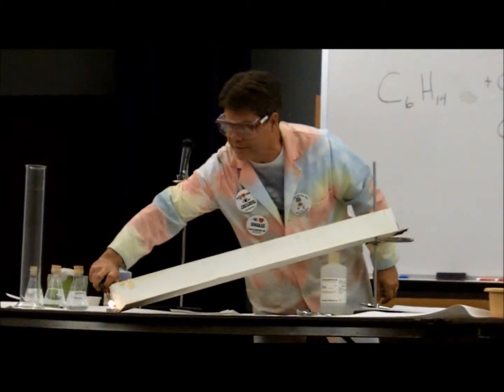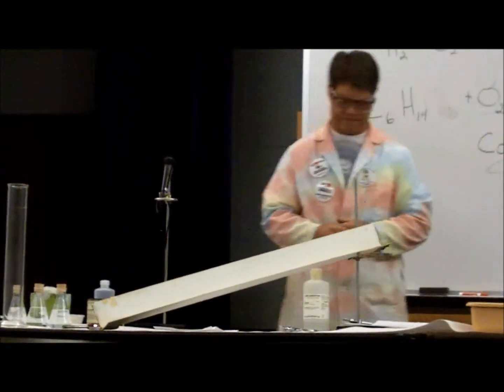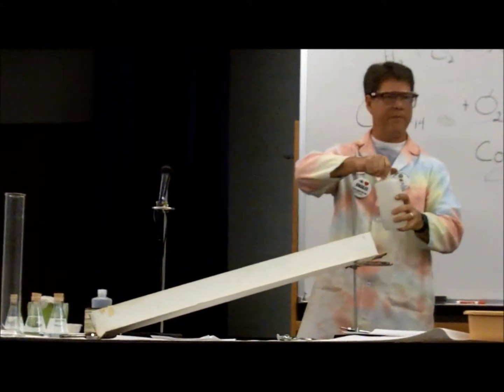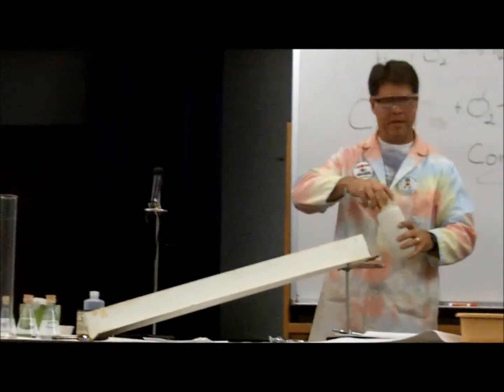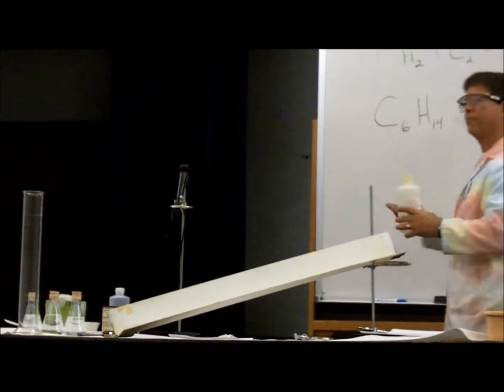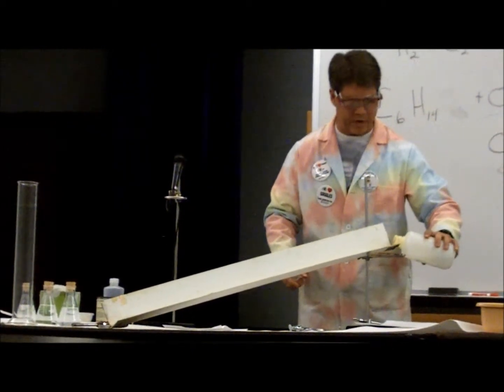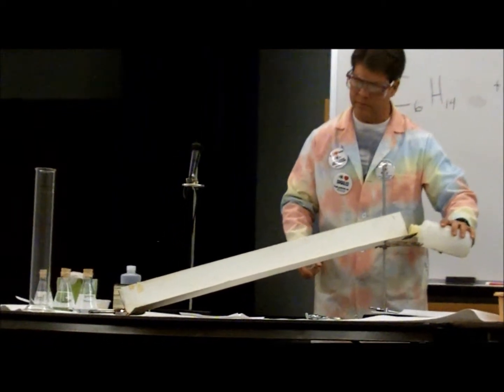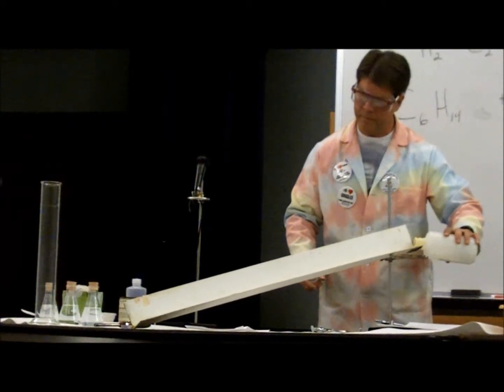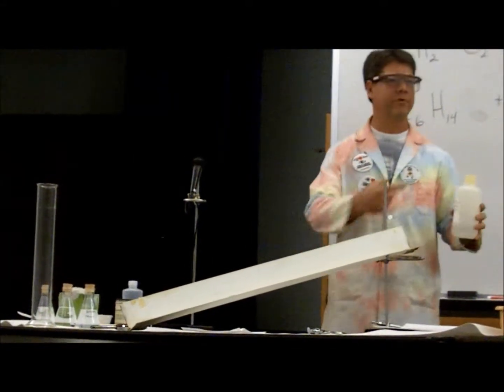And maybe simulate that this is your basement, and this could be the pilot light on your water heater, okay? And this would be your solvent or your paint thinner stored in a garage, maybe in a very unsafe area, right? And again, it doesn't take a liquid to create the fire. Notice all of these that have combusted have pretty much been in the gas state. So hexane is heavy enough that I can pour it right on down the ramp and it's invisible until it gets to the flame, where the combustion takes place and it burns right back up again.